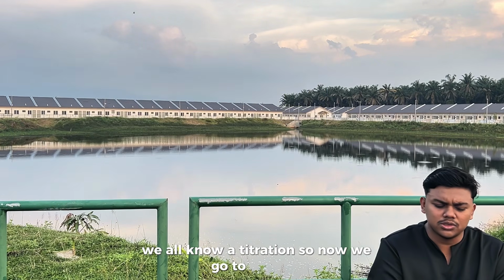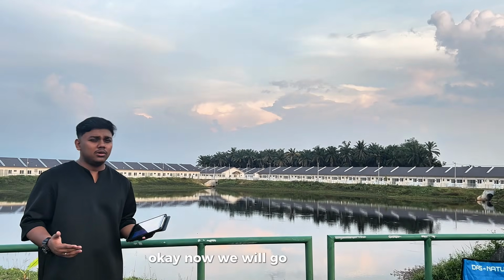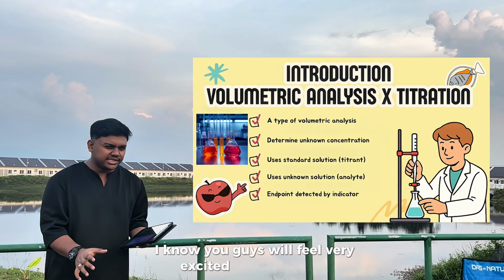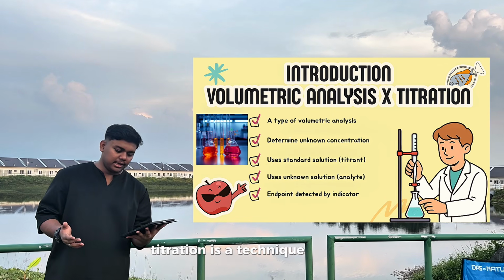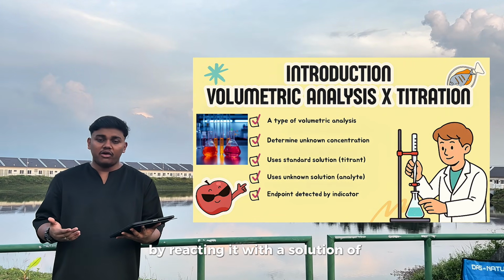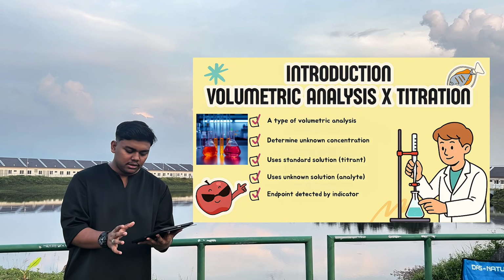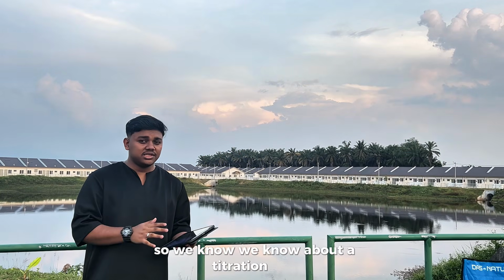So now we go to titration. I know you guys will feel very excited to know about this topic. So titration is a technique used to determine the concentration of unknown solution by reacting it with a solution of known concentration. An indicator is used to detect the endpoint through a color change. So we know about titration now.